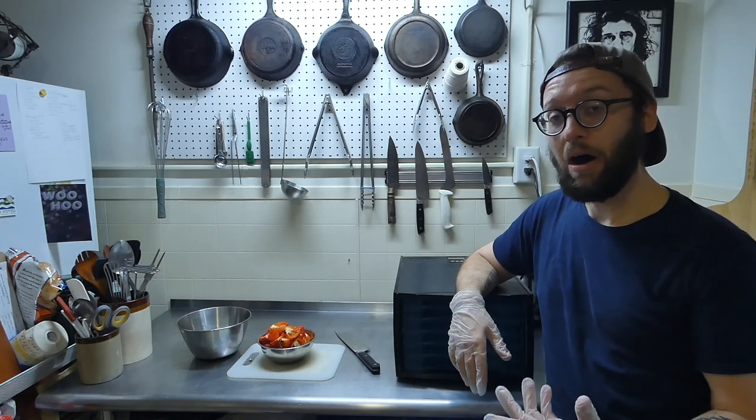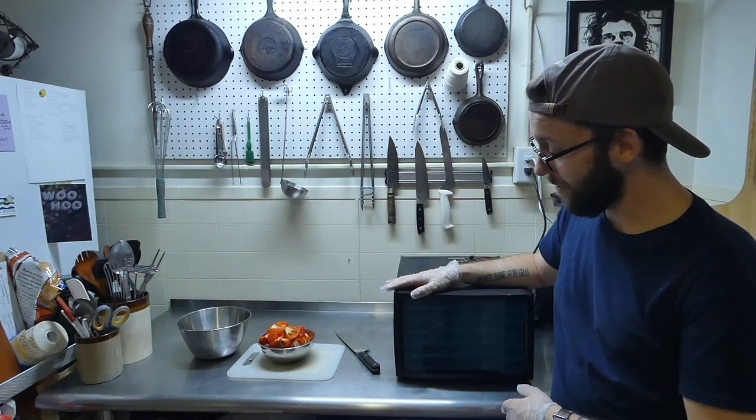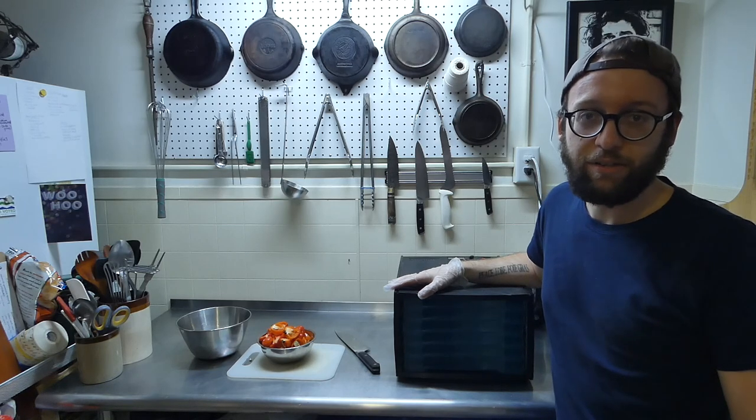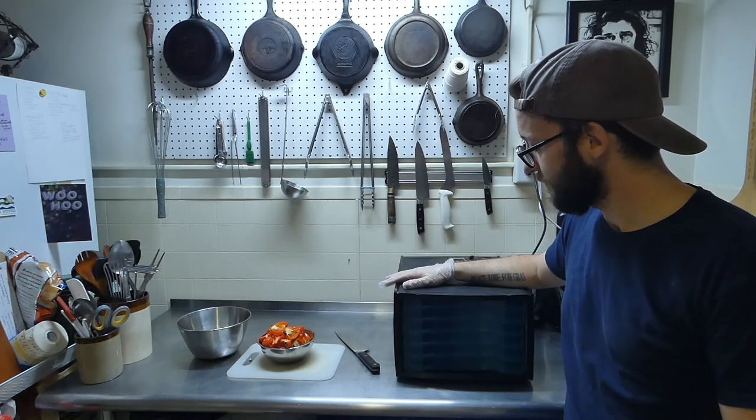So that's a long time to have your oven open and on. To do this, I would suggest just getting a food dehydrator. It's safer, it doesn't heat up your house a whole lot. If you're doing this in the summertime, your house is gonna be boiling if you have this oven on for 2 days. So get a dehydrator.